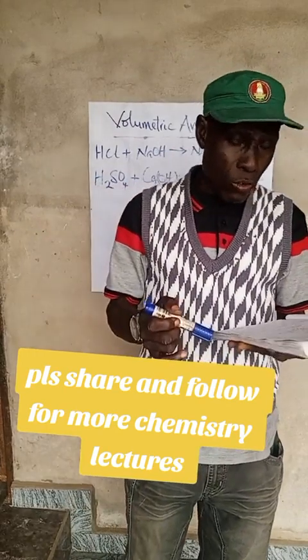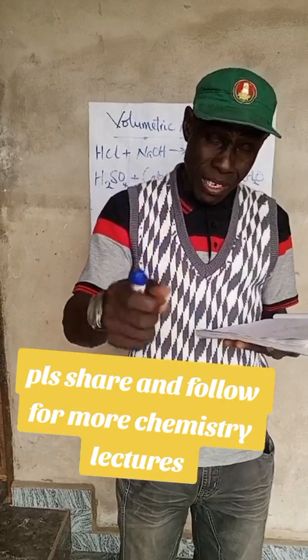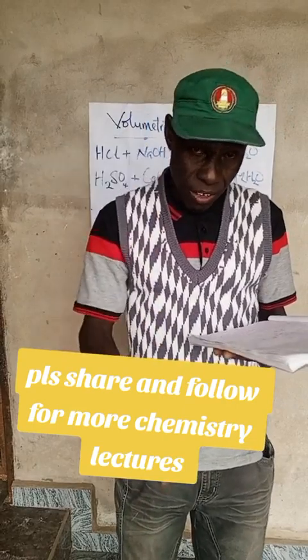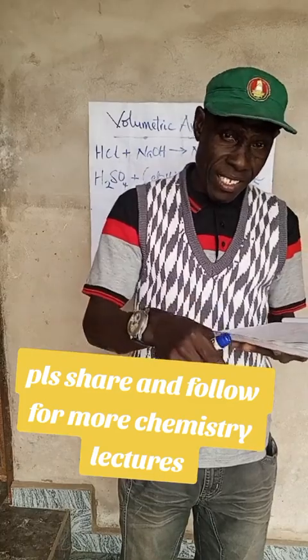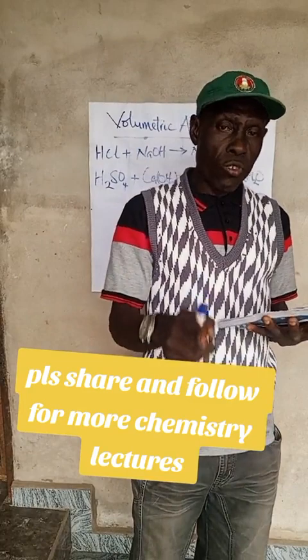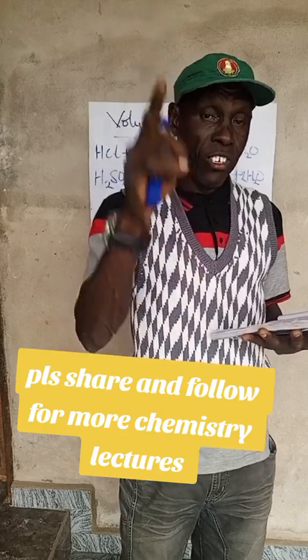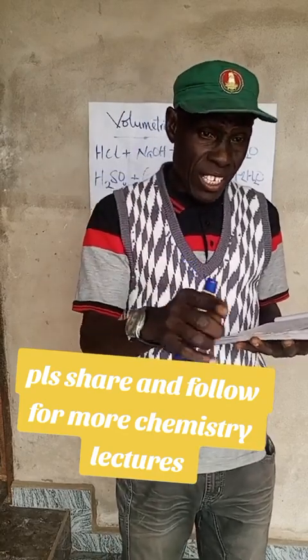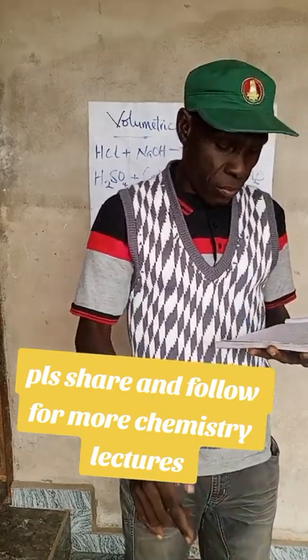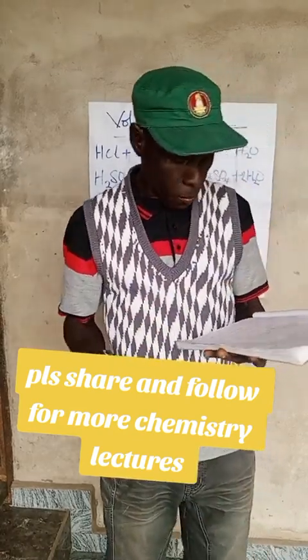Then you can now continue to run the acid through the burette by opening the tap. There's a tap on the burette. As you open the tap, the acid runs down against the base in the conical flask. But while you are doing so, don't look at the volume of the acid, how it runs. Only gauge the reaction between the acid and the base as the acid is running into the base, because the color change is on the base, not on the acid in the burette.